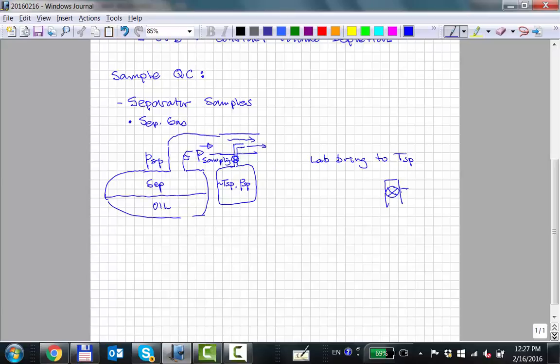They'll connect some kind of a pressure gauge onto this. Okay. And then they'll open the valve and measure the pressure inside the container. Okay? And they call this the opening pressure. So they just put a valve in, open the valve, and then measure the pressure.